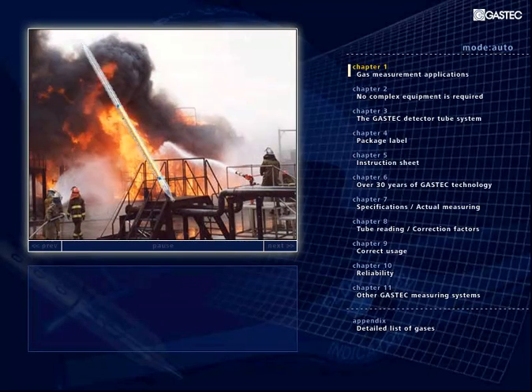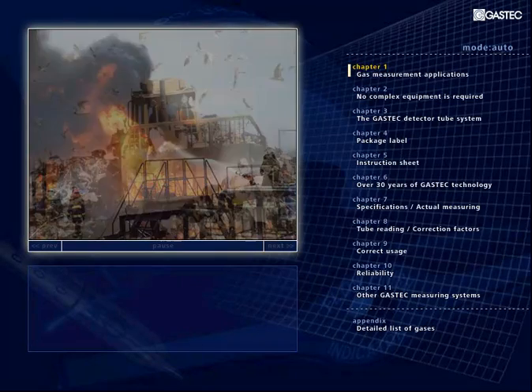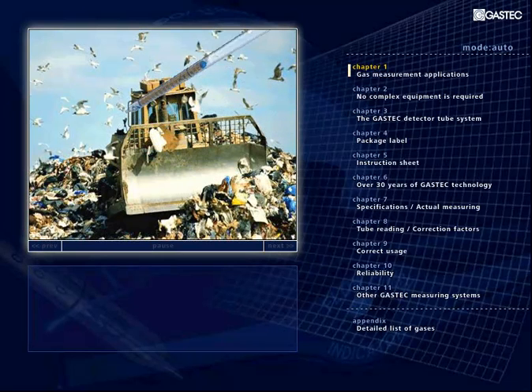At the site of a tanker truck accident or fire, there often is no way of knowing what hazardous substances are released. Determining their exact nature, composition, or concentration enables appropriate action to be taken. Discarded gas containers and other items dumped in junkyard, waste storage, or disposal sites often contain or leak unknown gases.